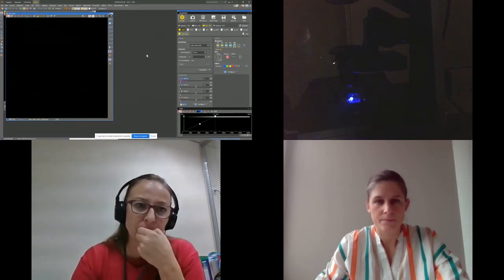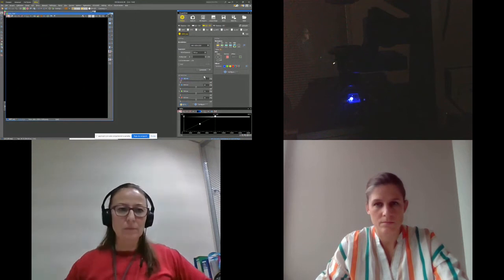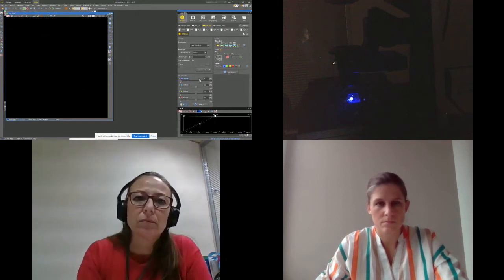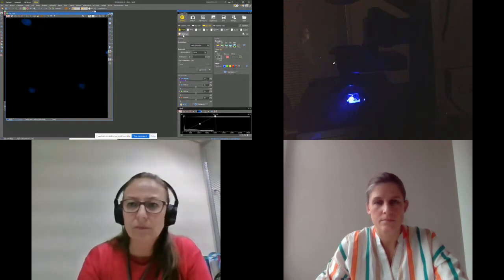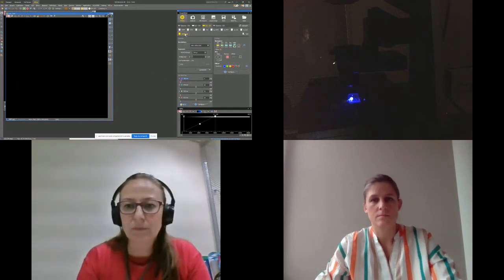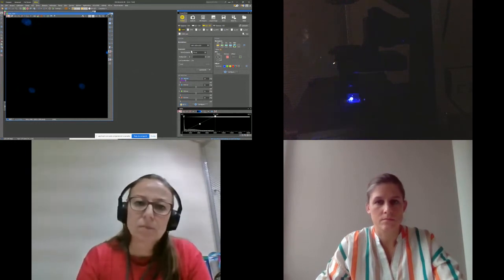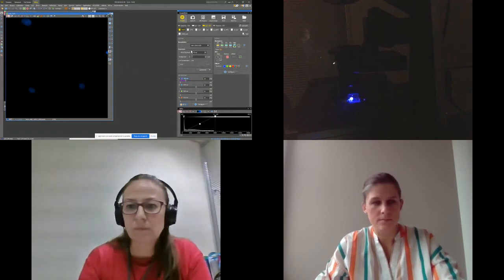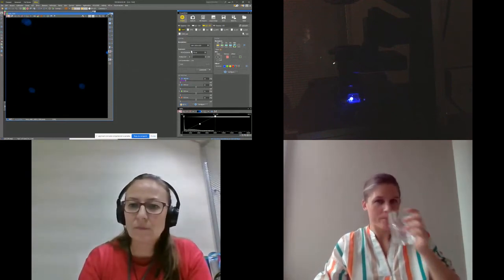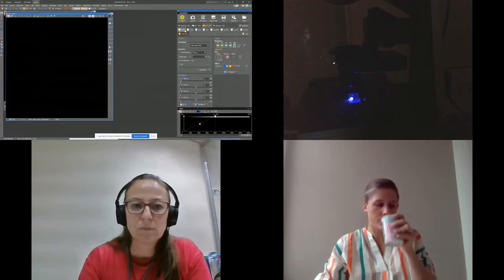That's a good condition for this sample. But we can try to simulate a very low light sample. Just by clicking the dot below, we can see that we have decreased the amount of light reaching the sample. It's just 4% at this moment, compared with the other one, which is 18%, so we can save a lot of light. But the main difference is the exposure time. The exposure time has changed from 50 milliseconds to 500 microseconds. So the difference in exposure time between the two images, DAPI low and DAPI, will be around 100 times, bearing in mind as well that we are using only a part of the light that we used in the normal capture.